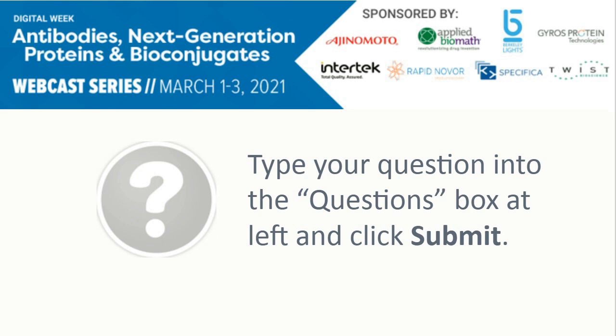We typically just do the IgG enrichment, and so we don't usually see too many IgMs in our samples. We'd be keen to talk further with you about that, but yeah, we just haven't done it.